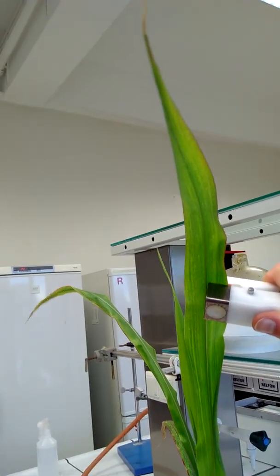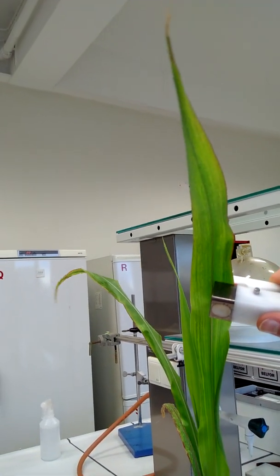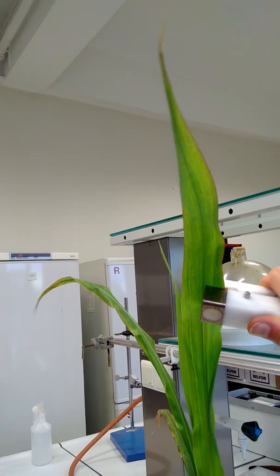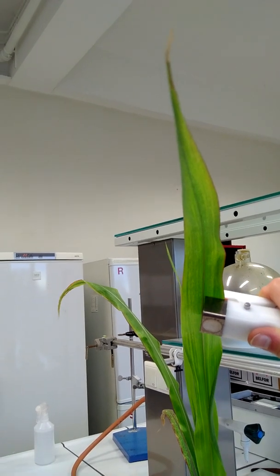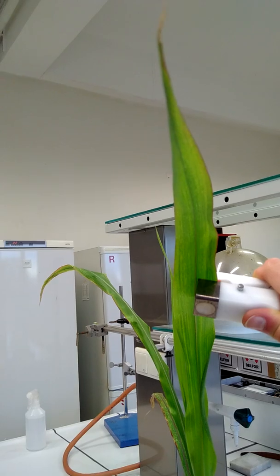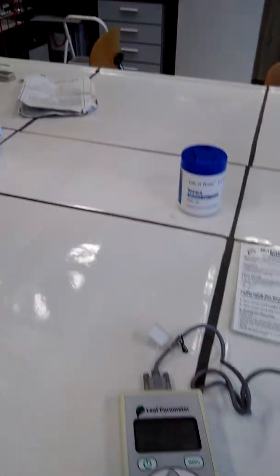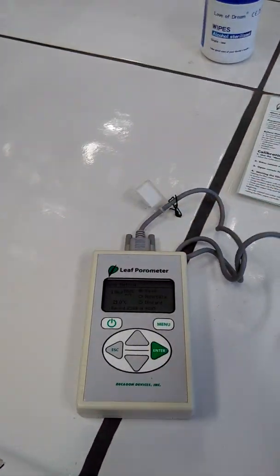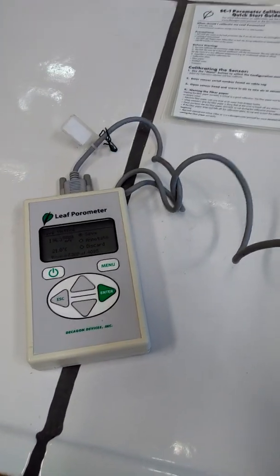And what this device does, it detects that at a certain point there's a threshold, and what it will do is just count 2 minutes. And then based on how much this concentration of water vapor has increased in the chamber, so it has a sensor there, it knows what the stomatal conductance is. Or actually the transpiration, but this device was calibrated earlier. I did it earlier in this room, and so it gives an idea of the stomatal conductance.